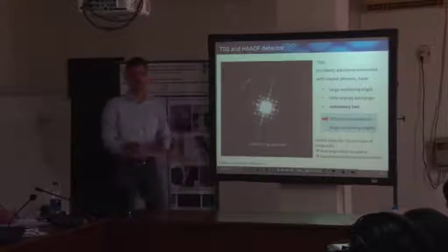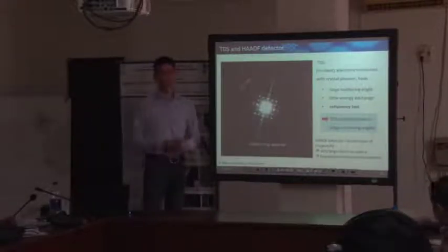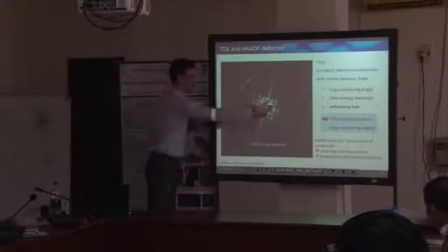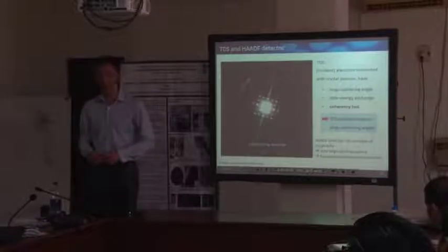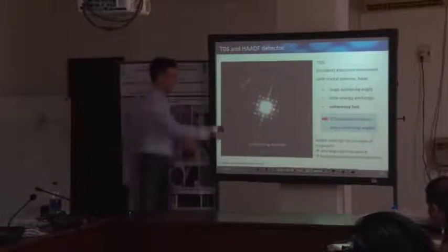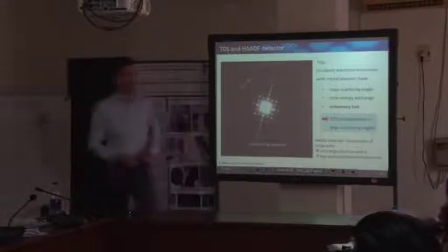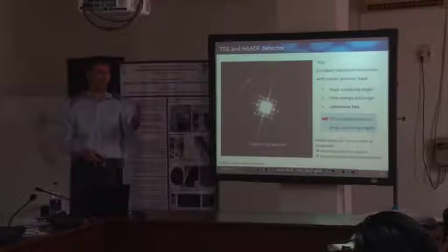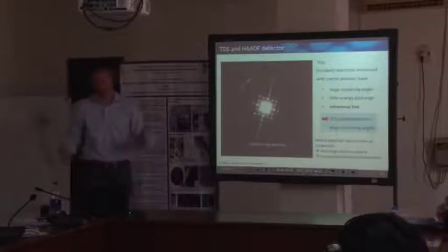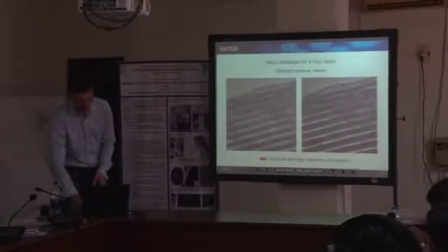If you like the bright field image more than a dark field image, this is not common, but in principle you might just shift that here. So for special applications, you can make use of the dark field detector like a bright field detector. This is the same with our electron detector in SEM, which we can also use for backscatter detection imaging, fortunately.